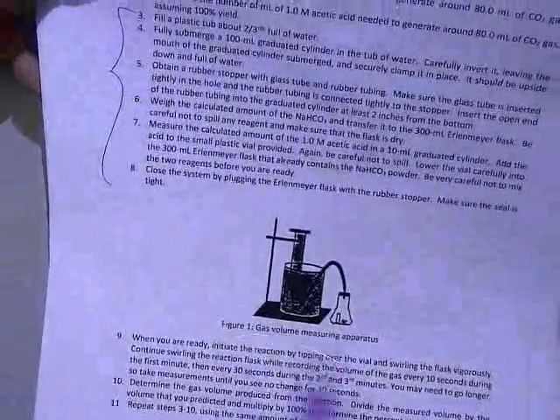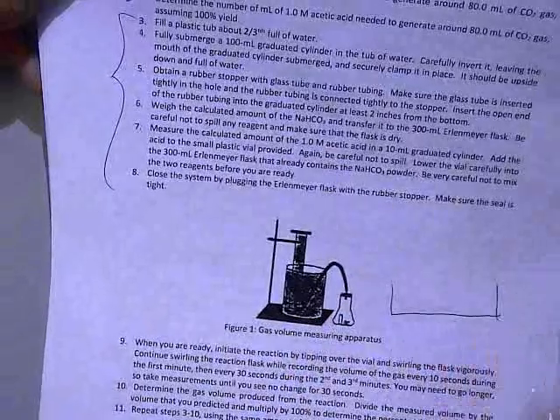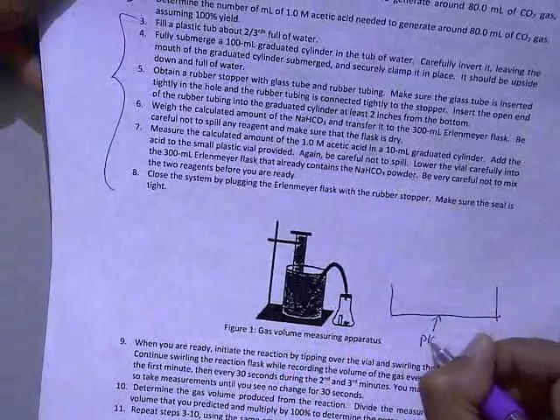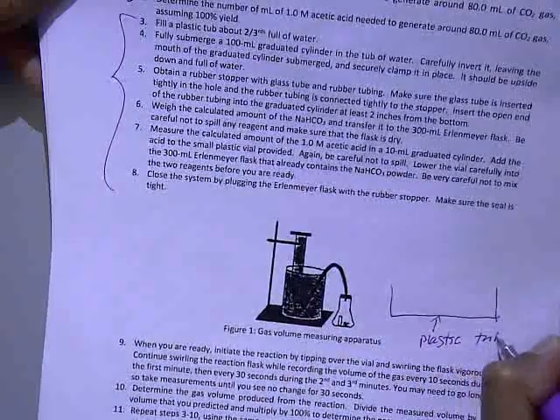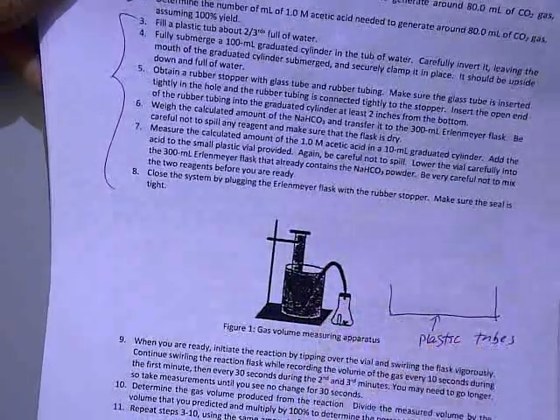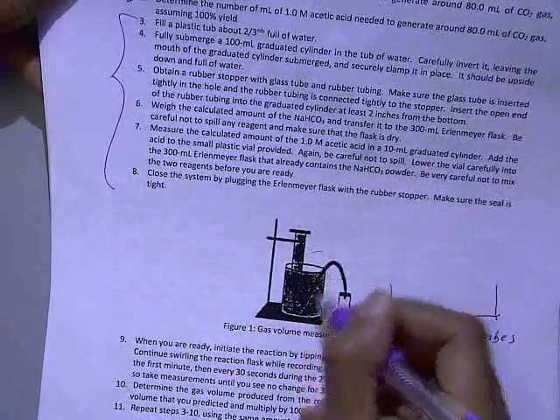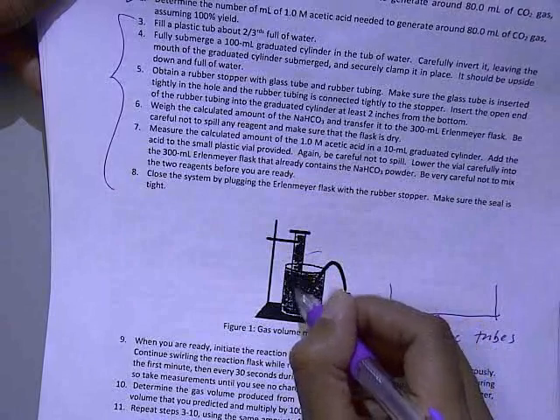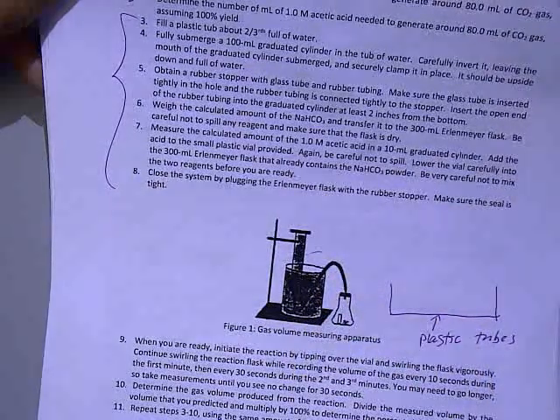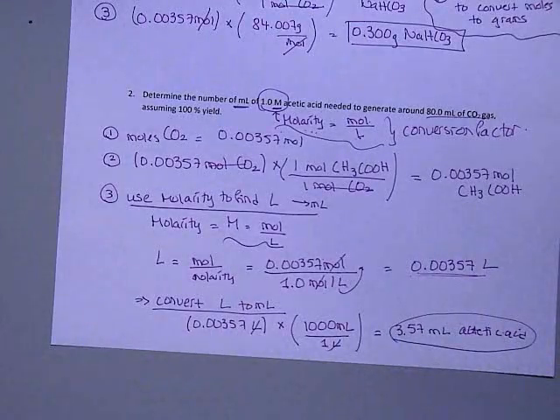There's a lot of interesting manipulation happening here. So instead of glass beakers, we're going to actually give you guys plastic tubs to give you and your lab mate more room to be able to invert this. Be very careful to not allow the graduated cylinder to tip over, and also this tubing has to be immersed into the graduated cylinder. Your lab instructors can demonstrate this. If you have questions, again, just email any one of us and we should be able to answer your questions for you. All right, great.